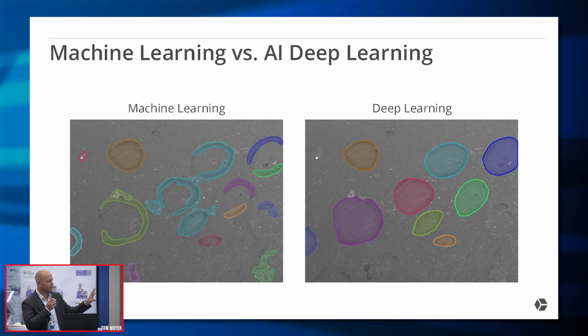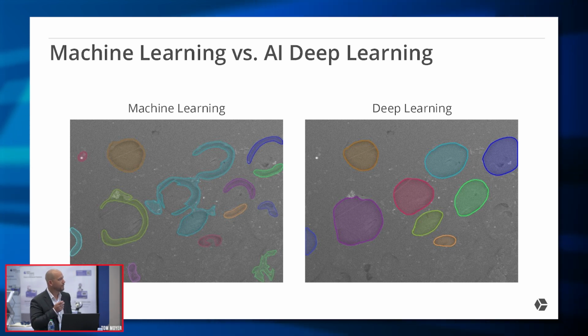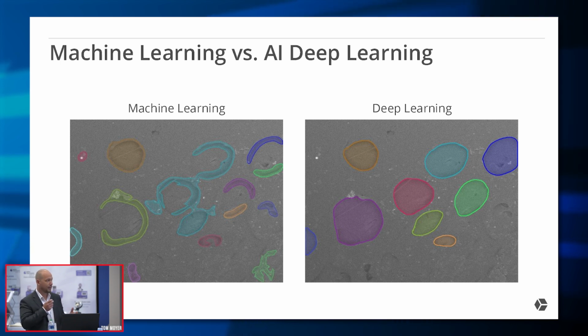And this image in particular, I have added some pre-filters and things to reduce the noise and make the segmentation a little bit more accurate. But it is a struggle for machine learning. The deep learning output was actually used with one of our general object pre-trained models. All we have to do is set an estimated object diameter size, and it has identified the objects in the image.